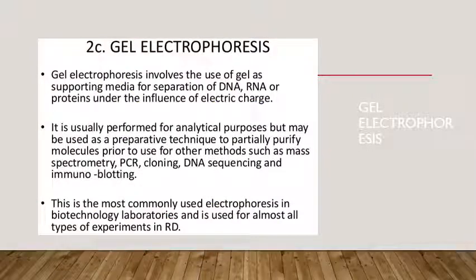The next type of zone electrophoresis is gel electrophoresis. It is a very frequently used separation technique to separate charged molecules. Gel electrophoresis involves the use of gel as a supporting medium for the separation of DNA, RNA or proteins under the influence of an electric field.